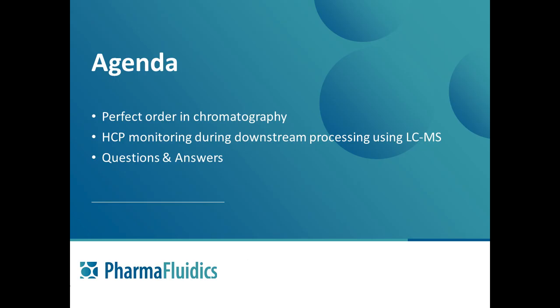This is what we will be covering today. First of all, I will give a short overview of the Micropillar array column technology. Then Dr. Koen Sandra from the Research Institute for Chromatography in Belgium will take over and cover the benefits that our µPAC columns can bring to host cell protein characterization. Finally, we will both be available for answering any question you may have.